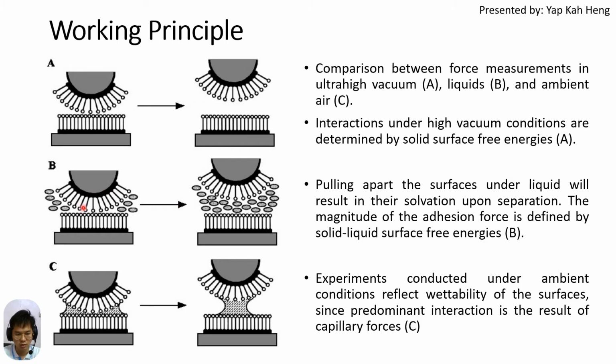When we pull the tip out from the sample, the liquid particle will go inside here, but it does not stick to the tip and the sample. It is just the liquid particle, but it has already gone inside. And the adhesion force is defined by the solid and the liquid surface free energy. So let us recall what the adhesion force is: the attraction force between different types of molecules.